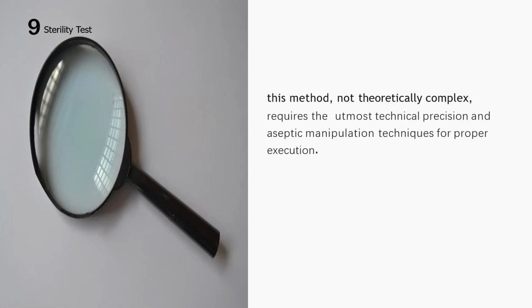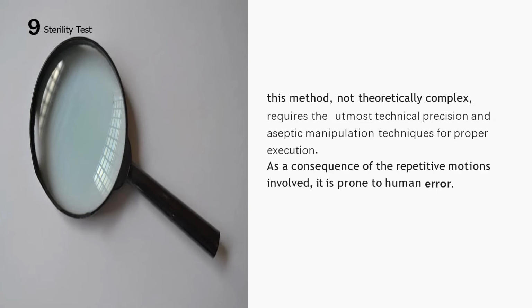This method, while not theoretically complex, requires the utmost technical precision and aseptic manipulation techniques for proper execution. As a consequence of the repetitive motions involved, it is prone to human error.